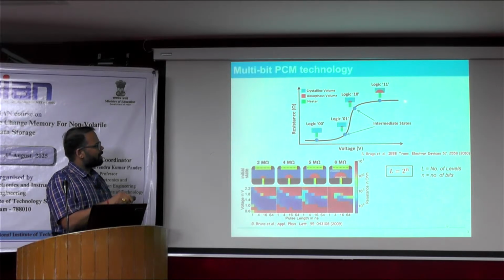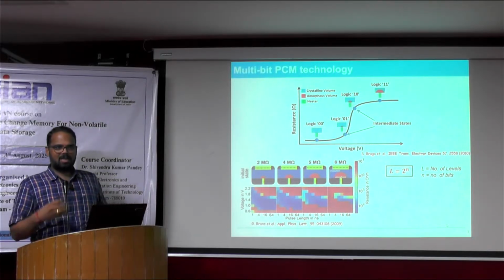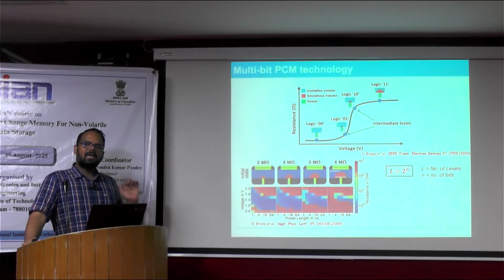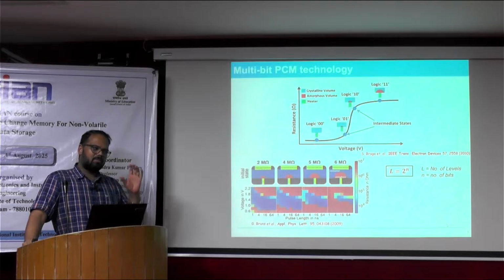The overall thing is that identifying the resistance of the material is also very important. Although this is the programming curve, initially how the material is performing, what the resistance contrast is, that is very, very important. For that, you need a resistivity measurement of the thin film. This is the prior and most important thing, to understand how the material contrasts.